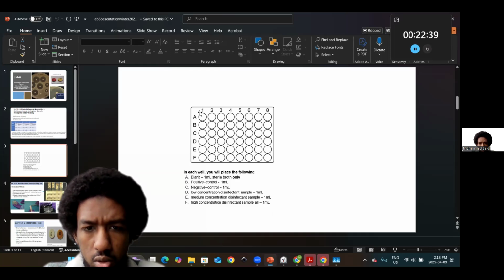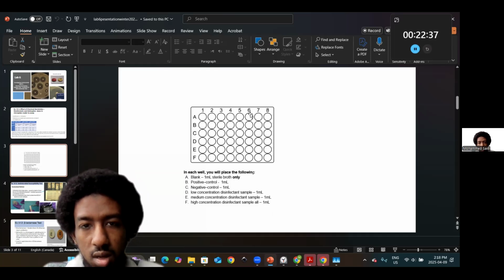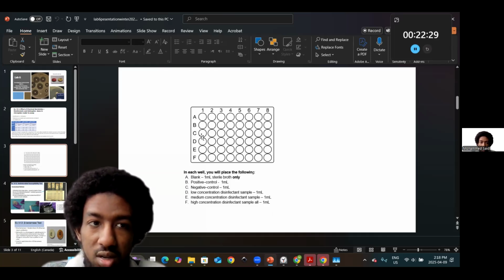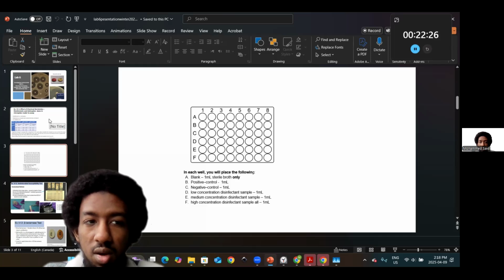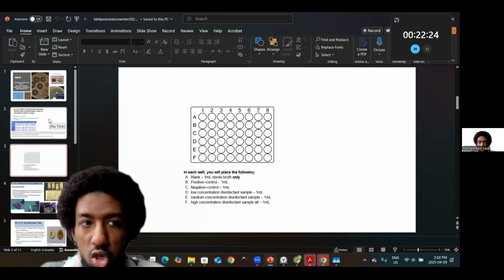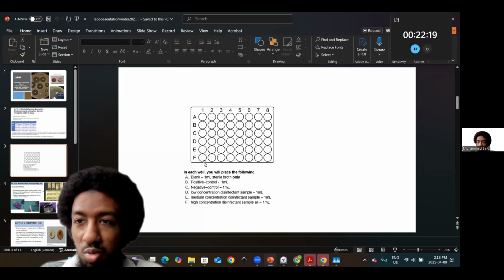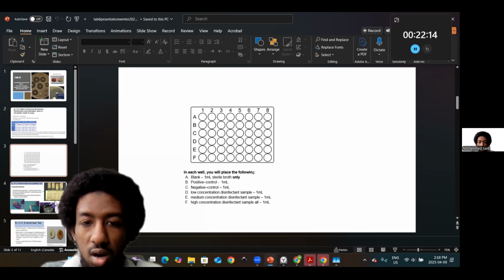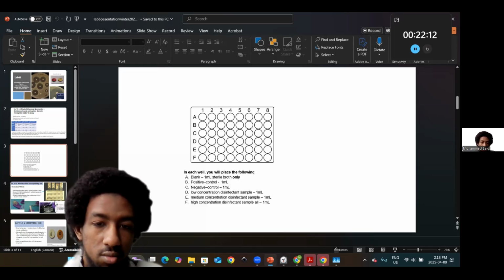It appears to be the blank across this row here. Then for each group, you would have labeled your tubes and resuspended the bacteria that had grown post incubation. What you would have hopefully come to appreciate is a change in turbidity readings, i.e., a change in absorbance values across changes in concentration of your germicide.